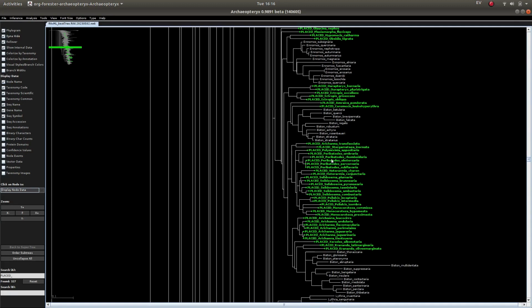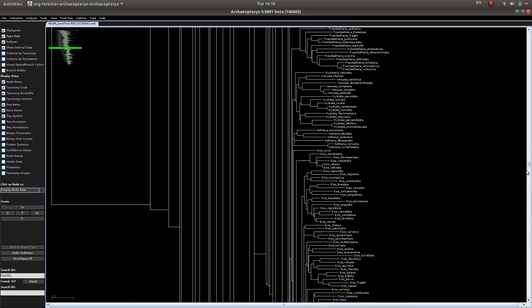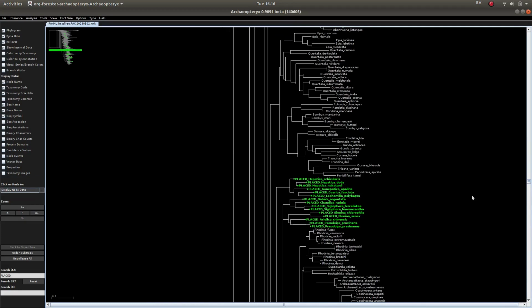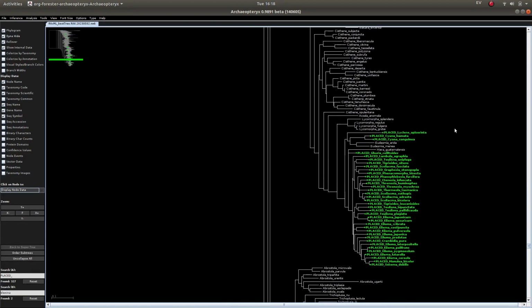We have a bunch of stuff from very different genera, all stuck in the same place. So after just an inspection, I'm really not happy with this. Same thing again. So I'll go back to the drawing board with this. It's a good thing I checked.